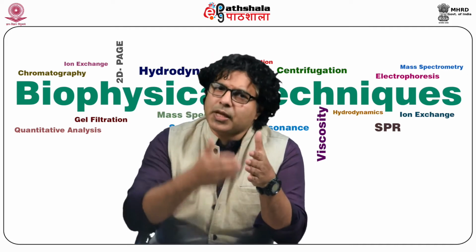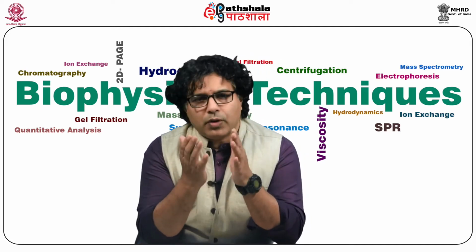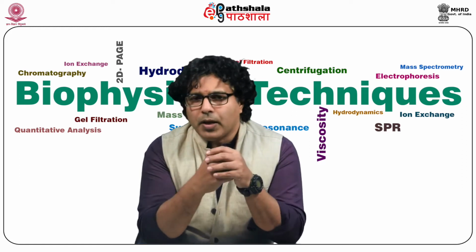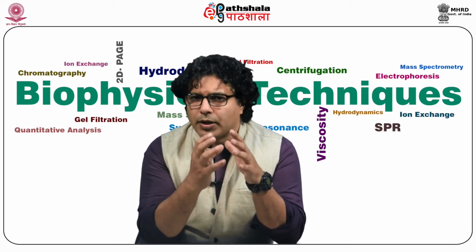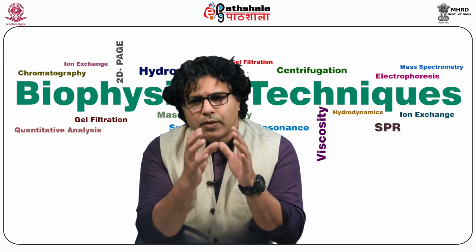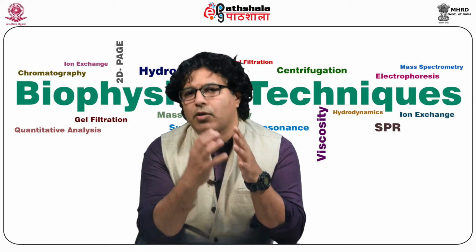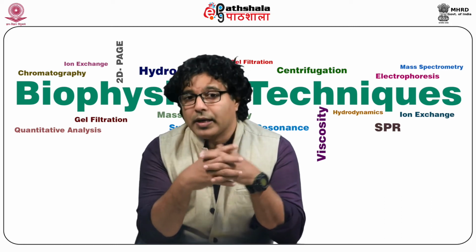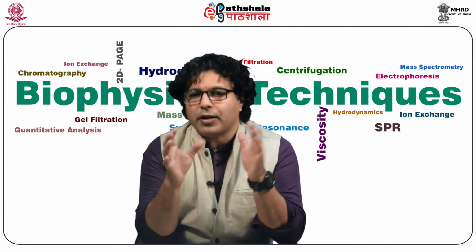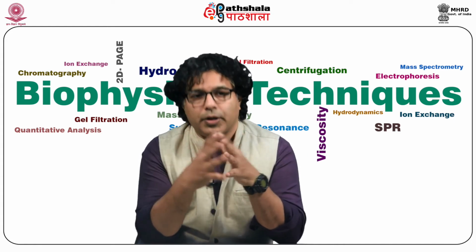This is subsequent fragmentation. You take a molecule, and you convert it to its protonated or deprotonated form. You bombard it with neutral molecules, and along with time, slowly you do this experiment. Stage by stage, you will be able to see how the structure is getting collapsed, and this gives us much information about its structure when you try to resolve the structure of an unknown compound. This helps us to identify new molecules.